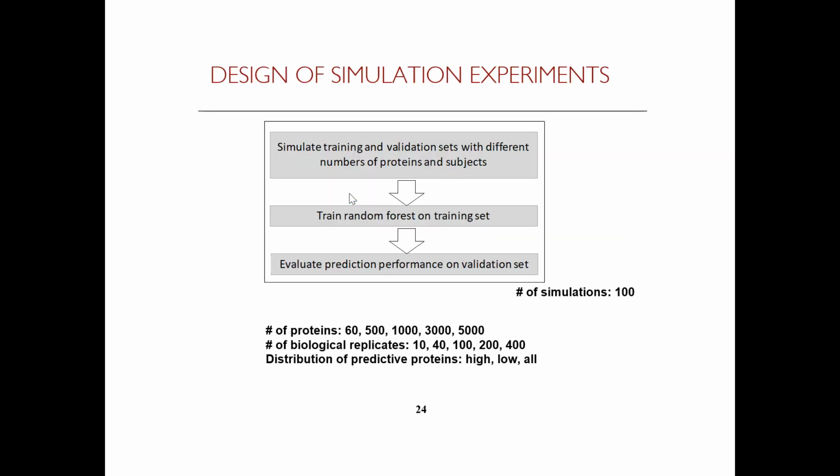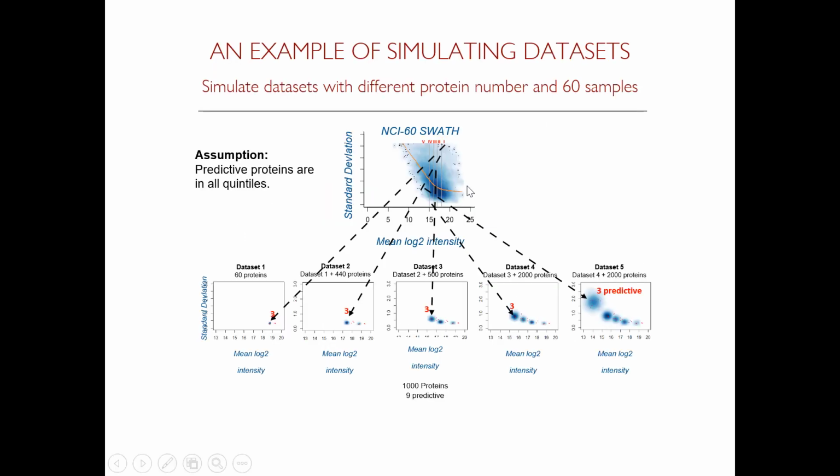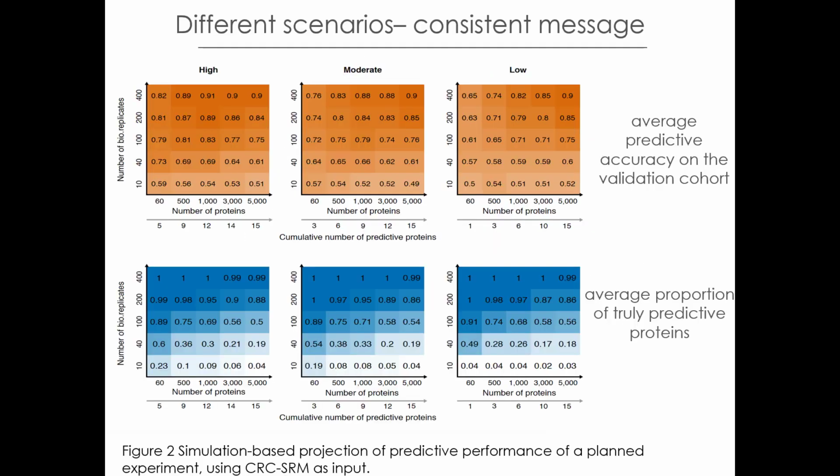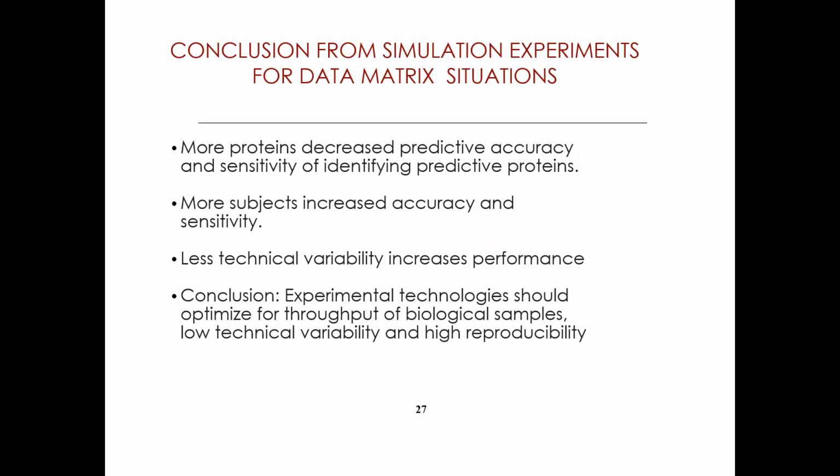But you can understand this very easily if you were to say, I'm coming in from the right-hand side where you have high signal-to-noise proteins, and then you keep adding more proteins, and the new ones will be increasingly low abundance with high variability. So you basically start to dilute out signals that you might have seen before by noise.